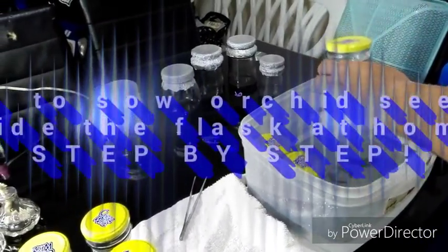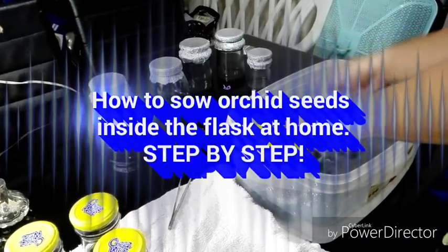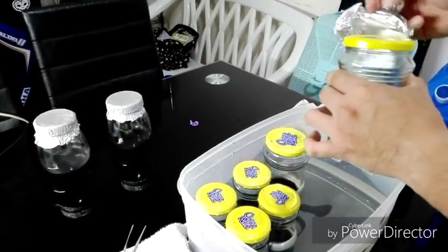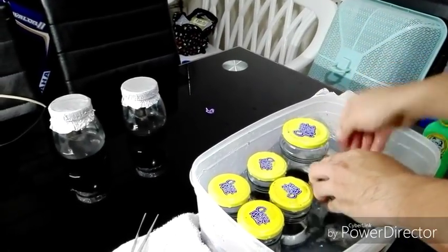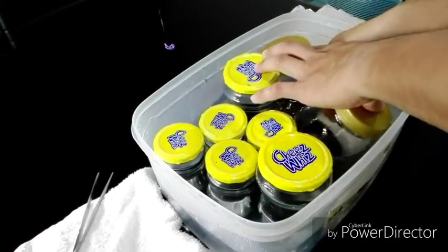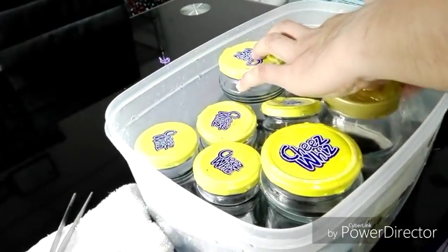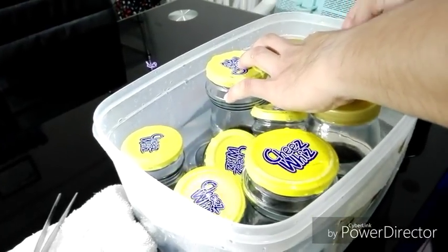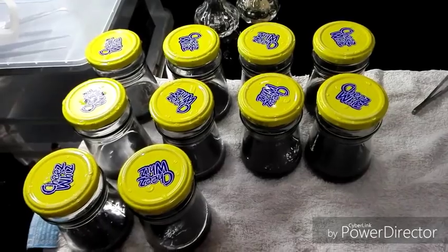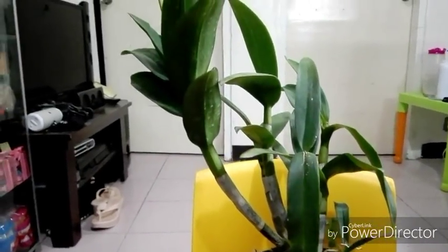Hello guys, this is Ryan of MyMixvideos Philippines. On today's video I will show you how I sow orchid seeds inside the flask at home. First, wash the flask in a bleach solution — I use two tablespoons of bleach per liter — and let it dry on a towel. Then prepare your seed pad for scrubbing.